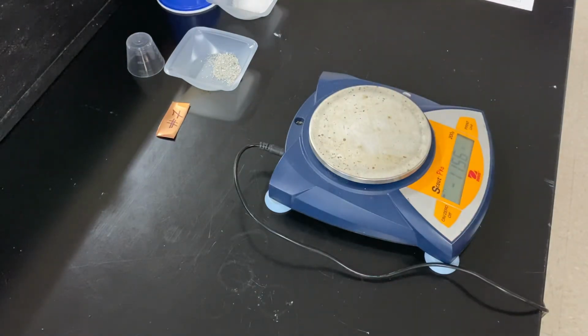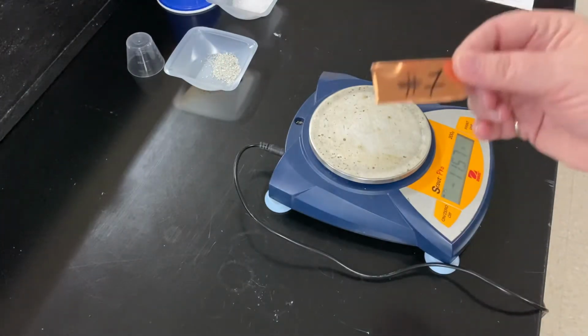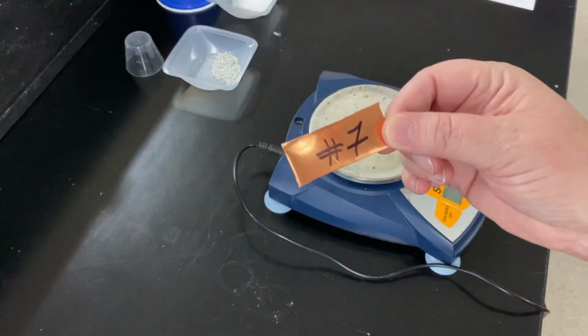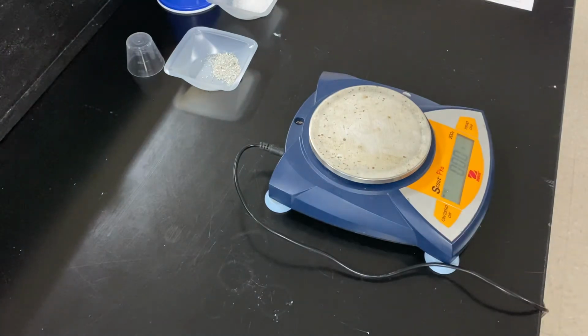Okay, next we're going to use copper sample number 7. Here is copper sample number 7. And you are to determine how many atoms are contained within copper sample number 7. So I'm going to zero the balance, and I'm going to carefully place copper sample number 7 on the balance, and it has 6.09 grams.